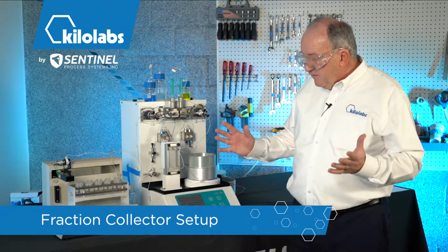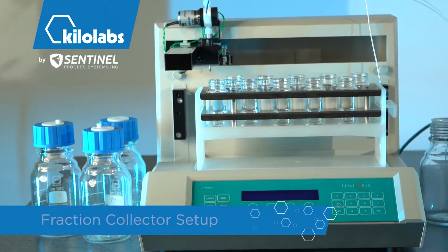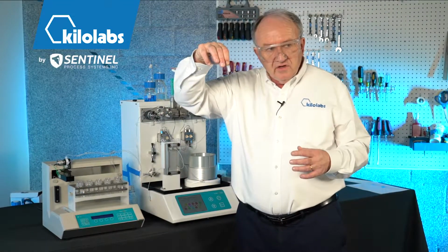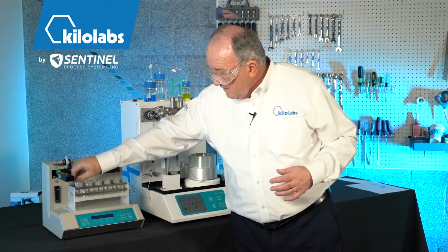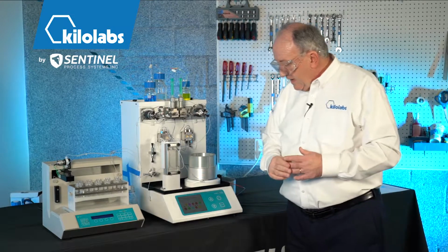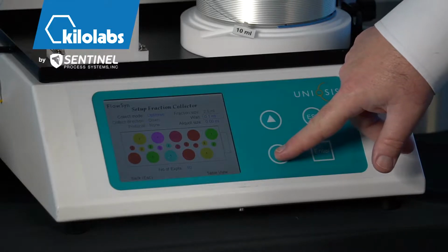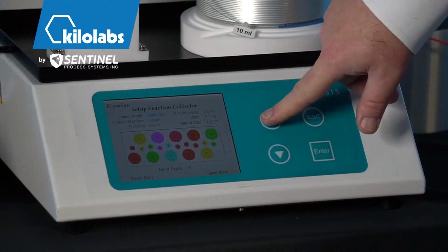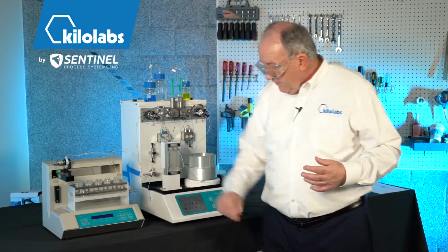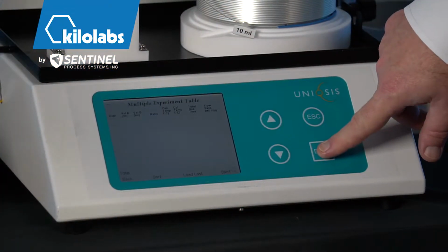Now there are many different types of fraction collectors that you can get, and the one that we have is called Optimize: collecting in an ampule a small volume that'll go directly into your HPLC, and also collecting on the same sample the rest of the volume that you've committed to the reaction. So that's the optimized fraction collector. The attributes of this: there's a wait time, which is 1/10 of an ml, and here I like to set that at 2/10 of an ml. The aliquot size is what you're actually collecting for your analysis. So now I come down to the table view after that to set up the automated experiments.